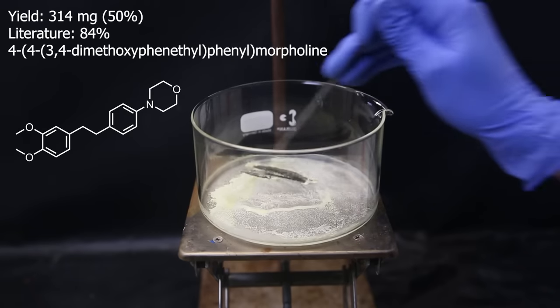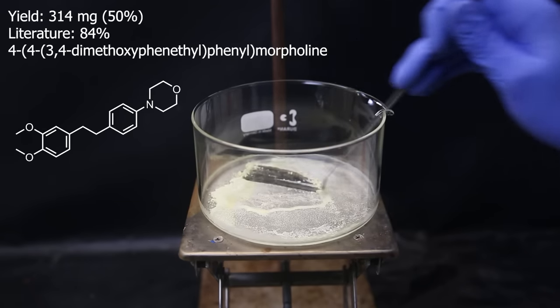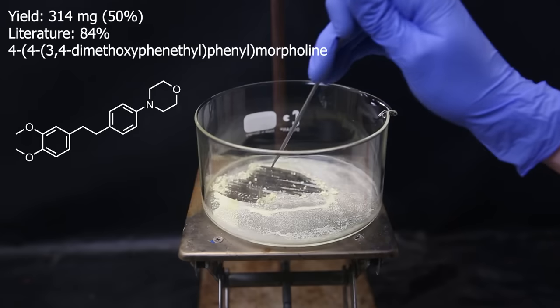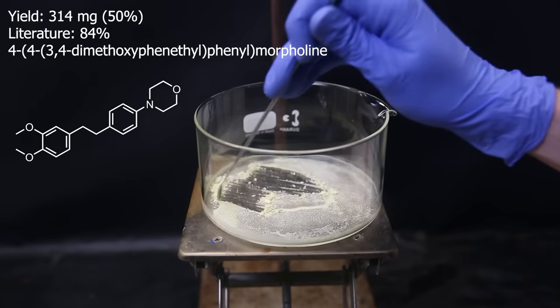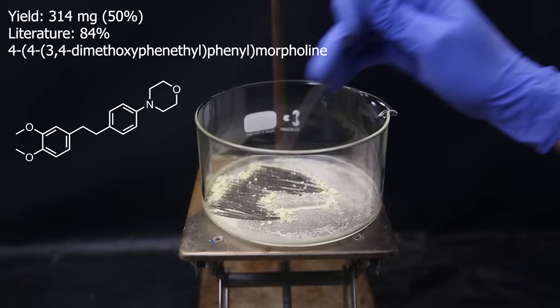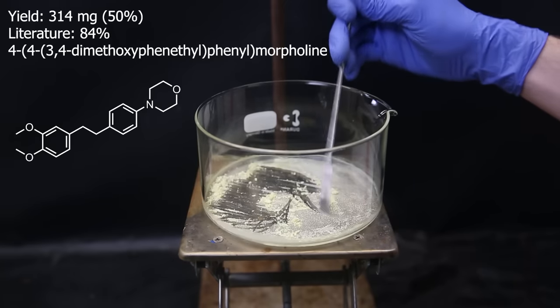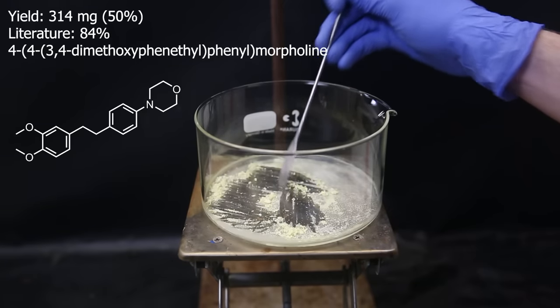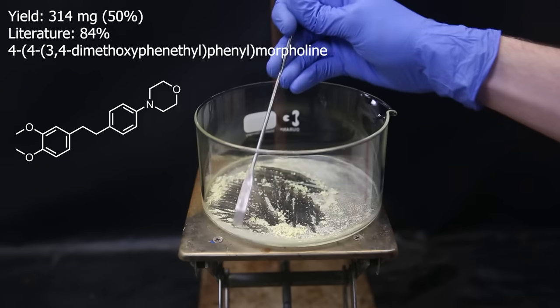I scrape it all off, and I am left with 314 milligrams of the product, 4-(4-(3,4-dimethoxyphenethyl)phenyl)morpholine. This is a yield of 50%, which is somewhat lower than the 84% from literature. But I did change the scale and increase the concentration, so that might be why. Either way, I can confirm that the literature on this part is reproducible.